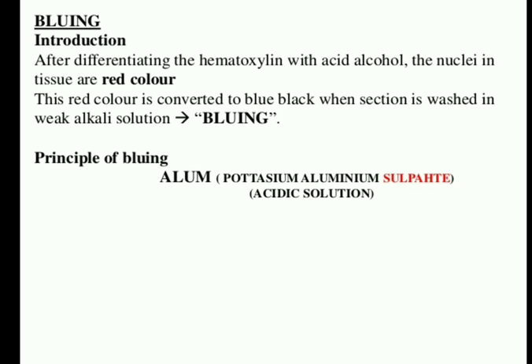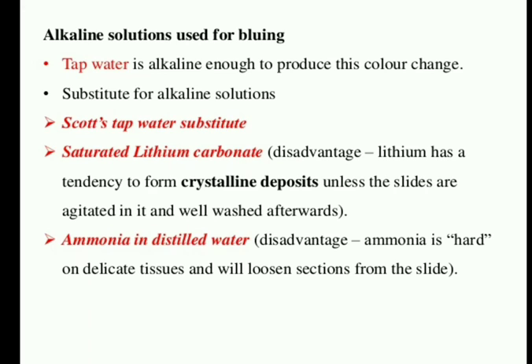This process is called bluing. Alkaline solutions that are used for bluing are tap water, Scott's tap water, saturated lithium carbonate, and ammonia in distilled water.